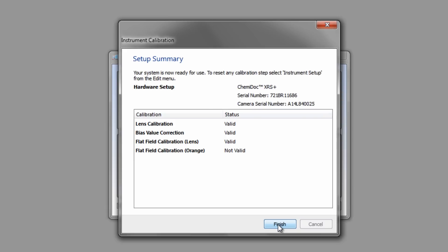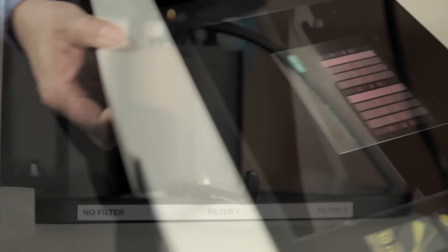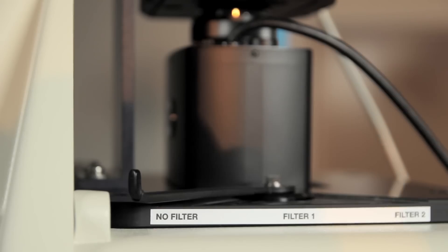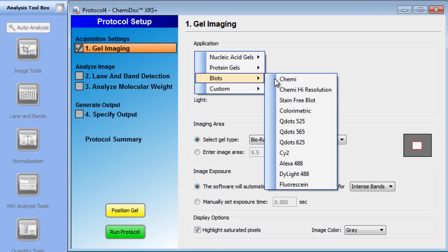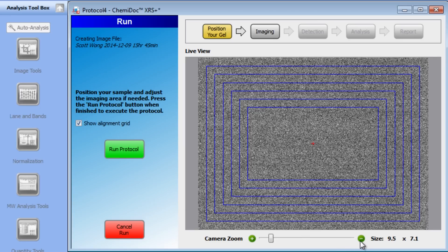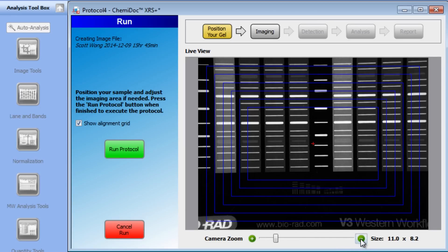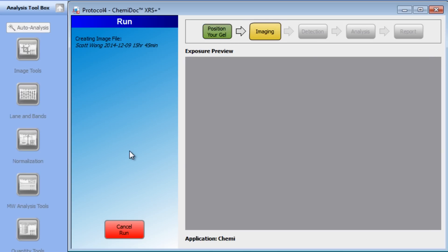Calibration is now complete and we're ready to test your imager. You can use the included target to test for chemi and UV imaging. Place the target on the imaging stage and move the filter slider to the no filter position. In ImageLab, click on the new protocol icon. For application, select blot and chemi. Choose manual exposure, set for 10 seconds and press the position gel button. You will now see a live view of the target. Once it is centered, press the run protocol button and the final chemi image will appear.